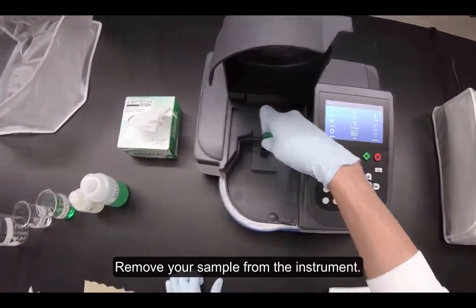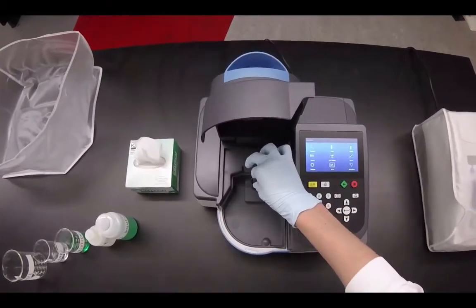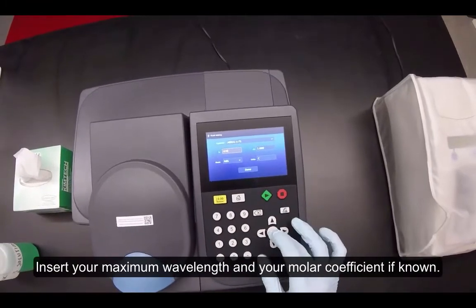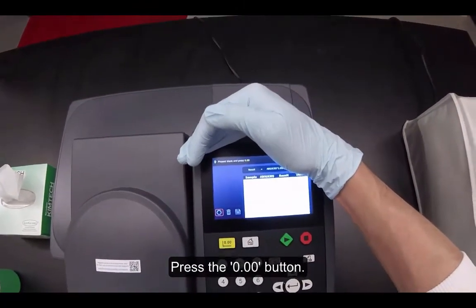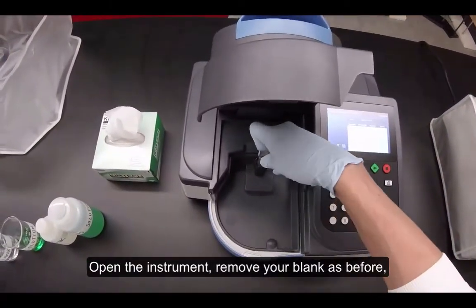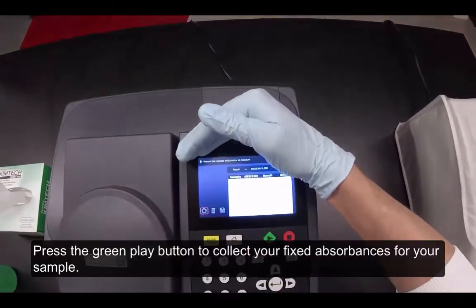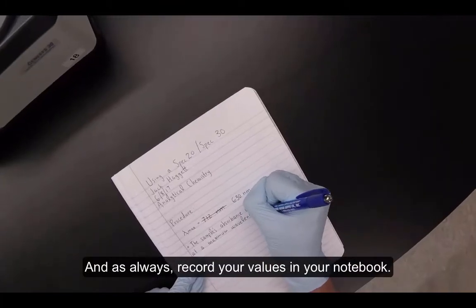Remove your sample from the instrument and reinsert your blank. Navigate on the home screen to the fixed setting. Insert your maximum wavelength and your molar coefficient if known. Navigate past the next two selections and press the enter button. Press the zero button. Open the instrument, remove your blank as before, and reinsert your sample. Press the green play button to collect your fixed absorbances for your sample. As always, record your values in your notebook.